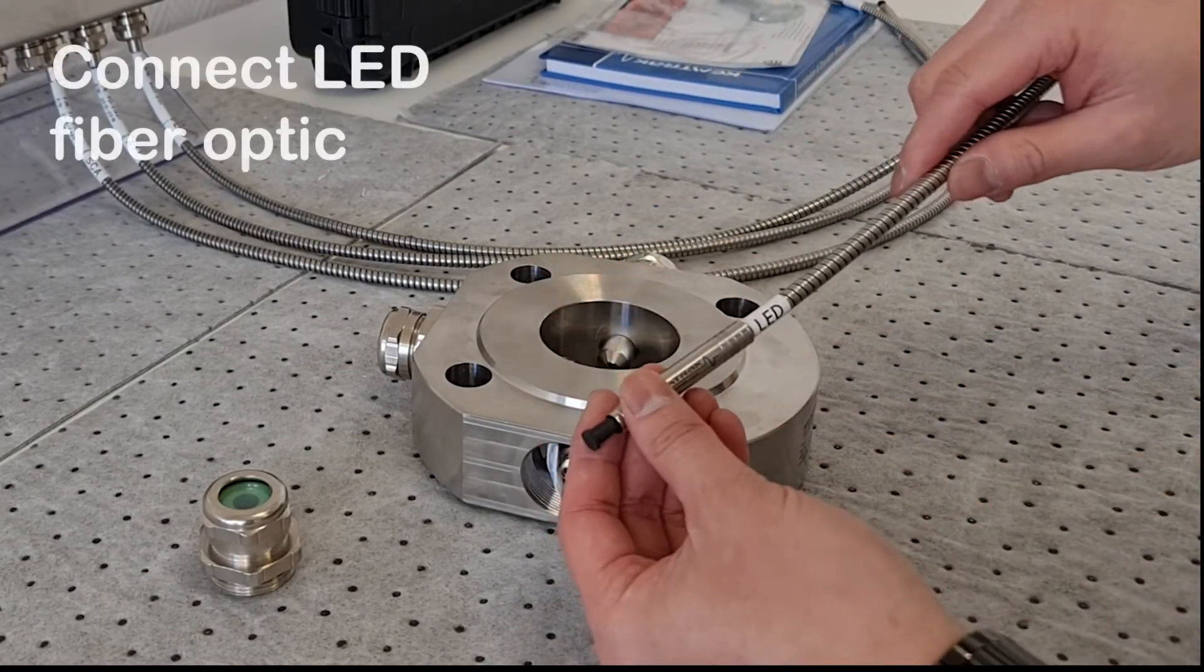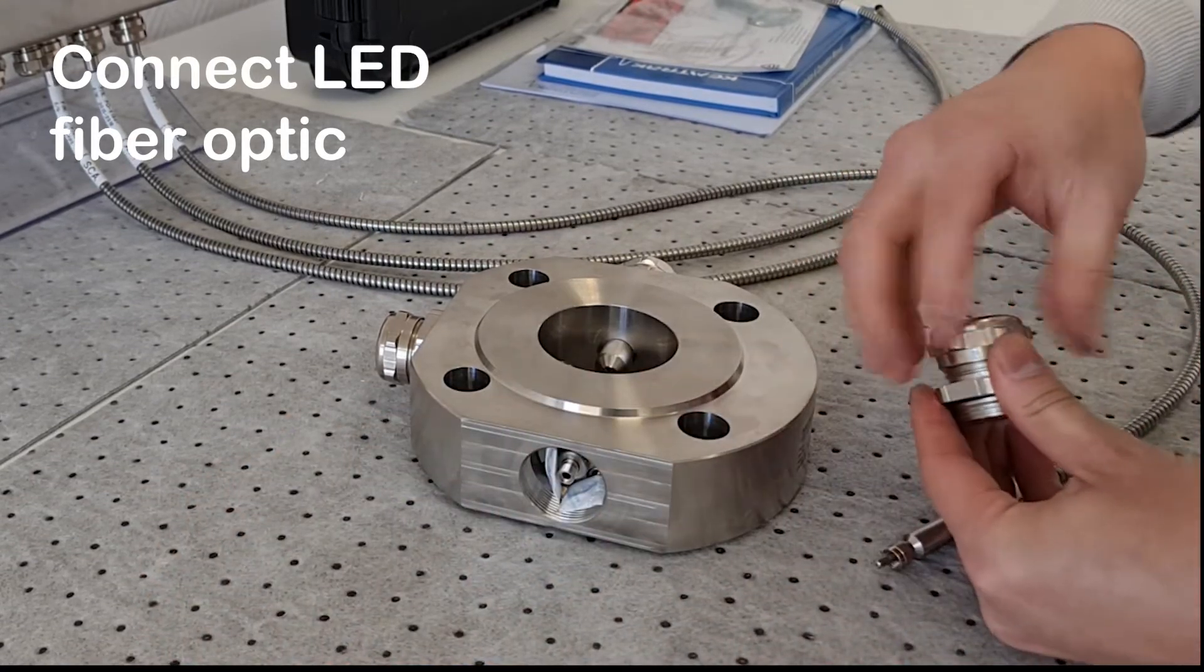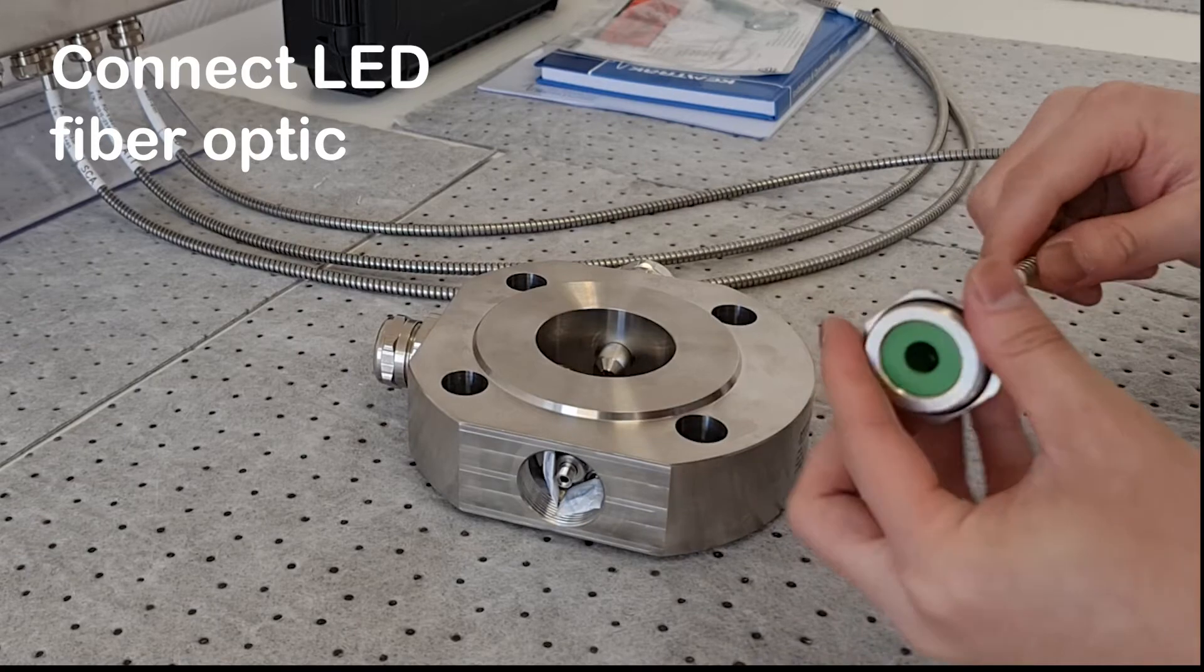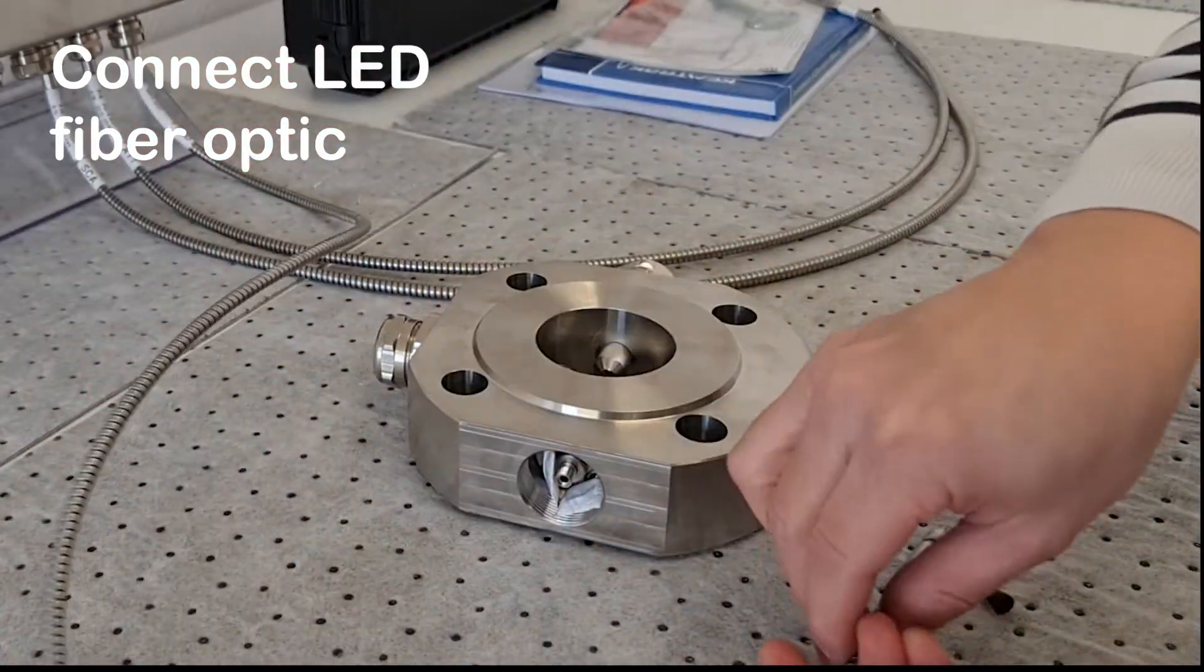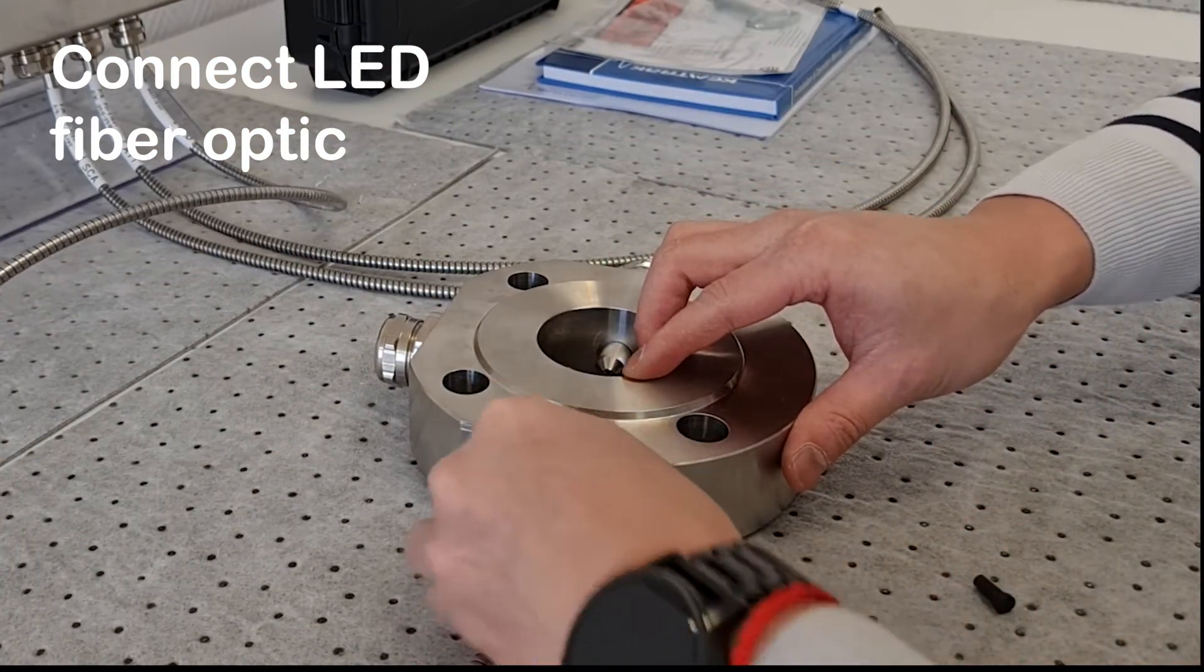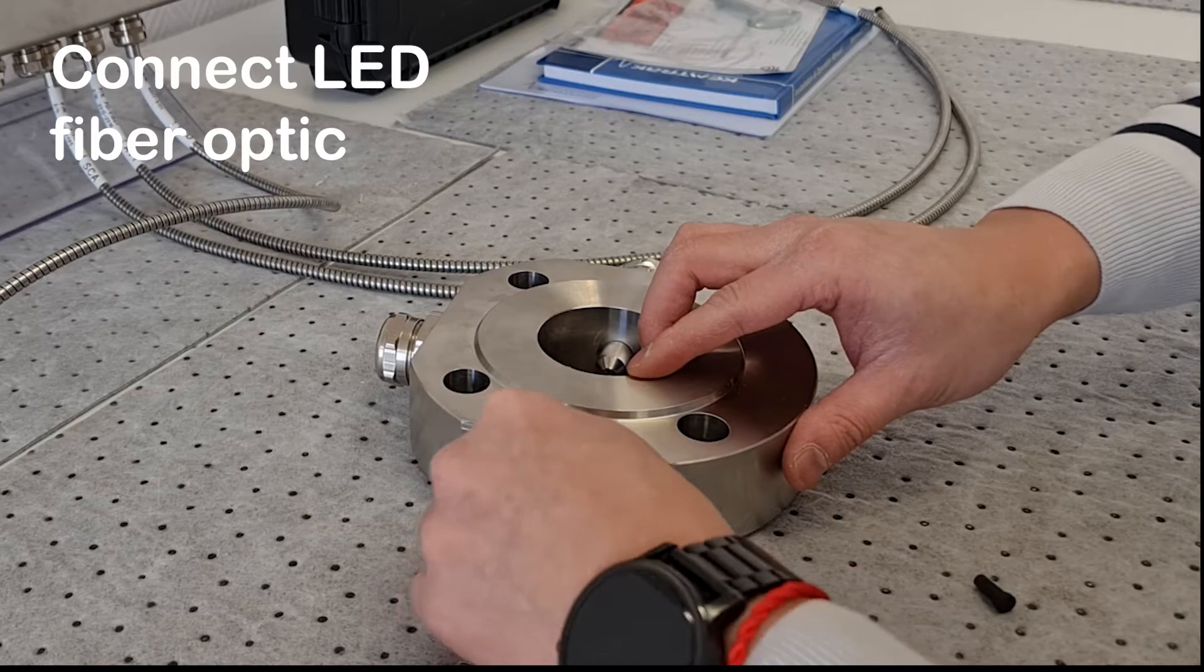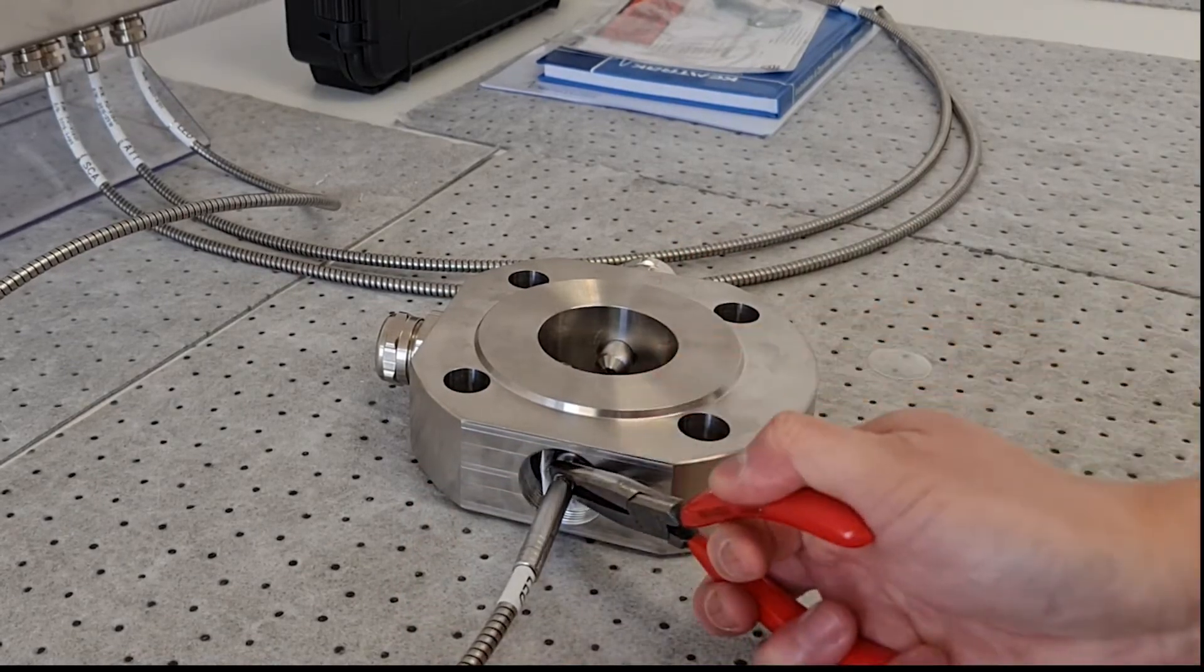Connect the fiber marked LEAD to one of the two ports facing one another. Hand tighten the fiber optic connector to the measurement cell, then use a pair of long nose pliers to assure the fitting is firmly attached.